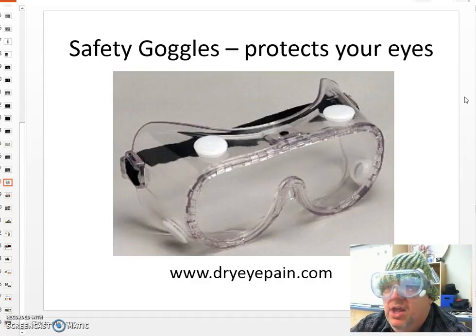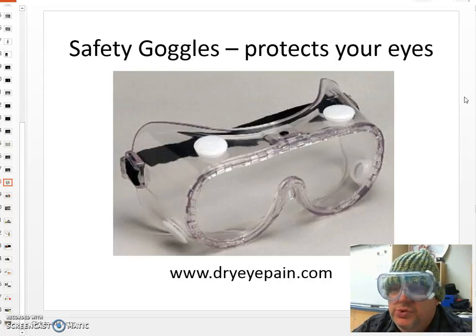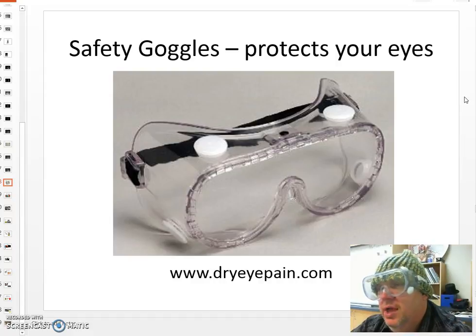Now the thing about safety goggles, they do protect the eyes. Because if you lose your eye, glass eyes do not give you back your field of vision. You lose some of that 360 field of vision capability that you have. At the same time, you lose some of that three-dimensional vision as well. So we want to protect your eyes. You want to protect your eyes very much.